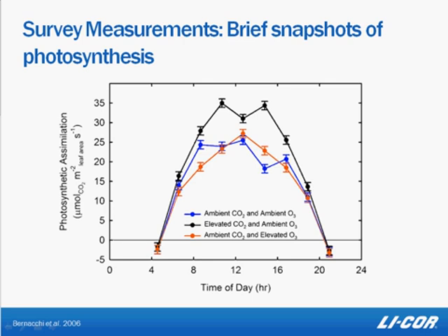The plants in this case were exposed to ambient or elevated carbon dioxide or ozone, and you can see that their response changed over the course of the day, depending on the treatment type. By looking at the plant's response to the various treatments over the course of the day, we could develop some hypotheses as to what might be driving that response. It could be nutrients, or water availability, or temperature, or maybe something else entirely.